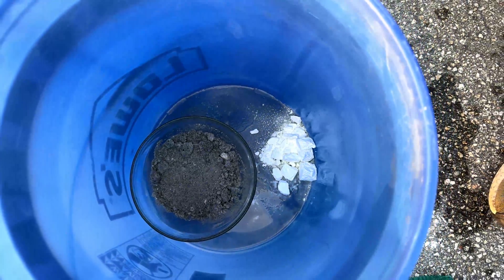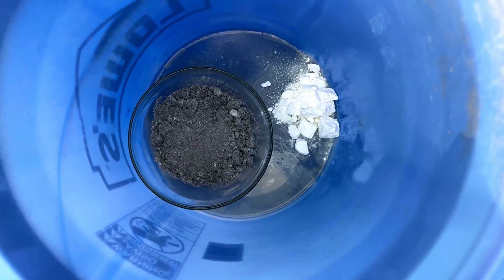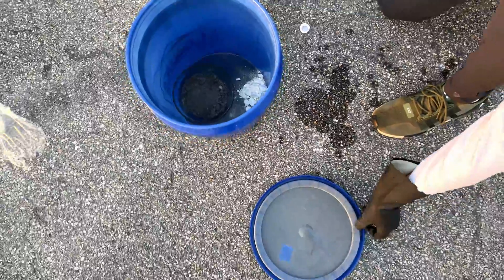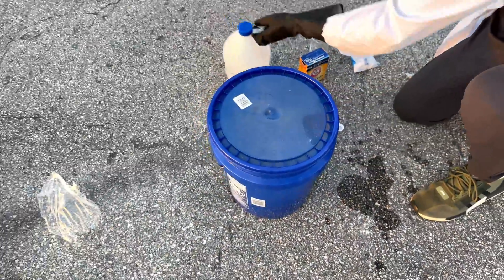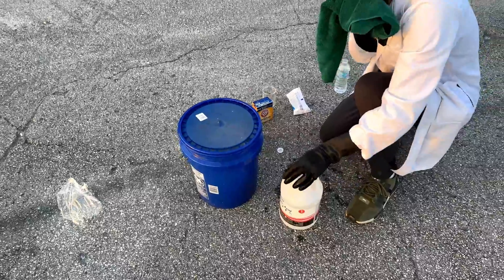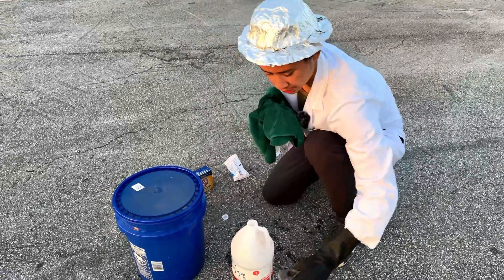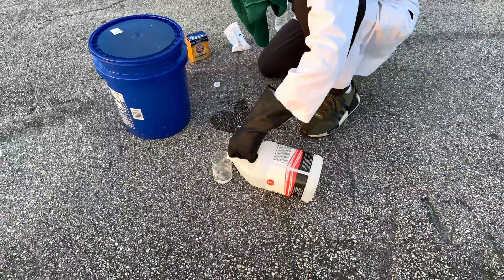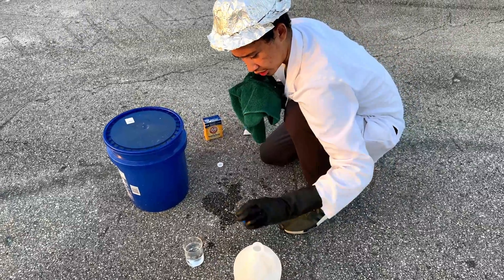We already got some chlorine gas going. Next you want to put on your rag — seal it, seal it a little bit — and then get your muriatic acid ready. We have to work quickly because the chlorine gas will get overwhelming fast. About 200 mL should do the trick.